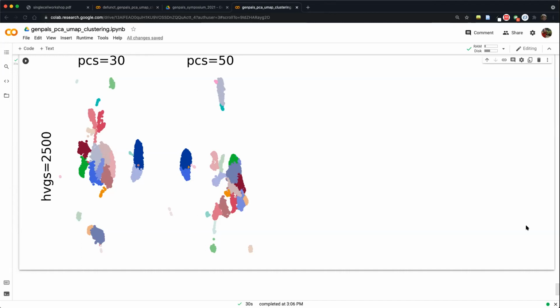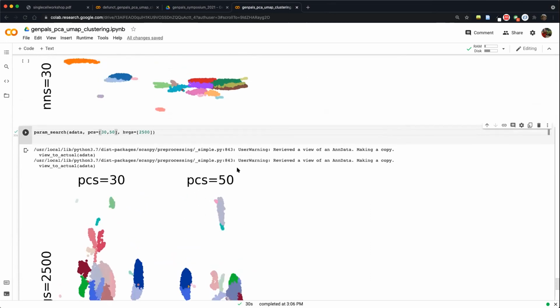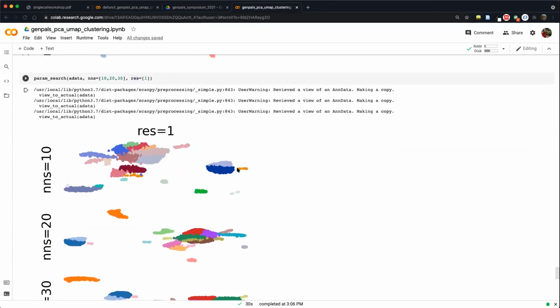I don't know if Paige wants to try to take that question. Maybe understanding this, there's no real guarantee. One way to explain that, one way to try to change that, I think the basic is there's no real guarantee. So empirically, we need to try it.